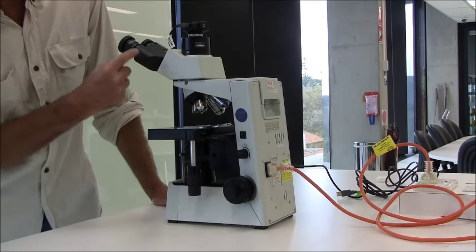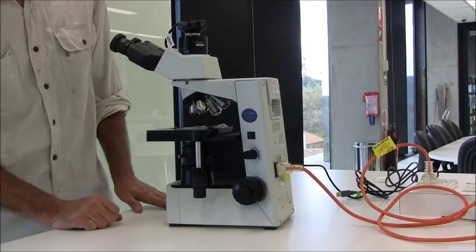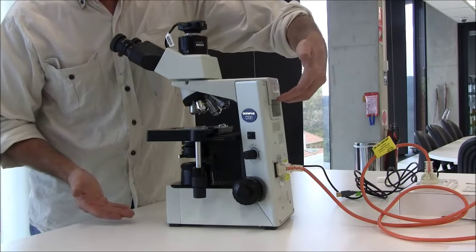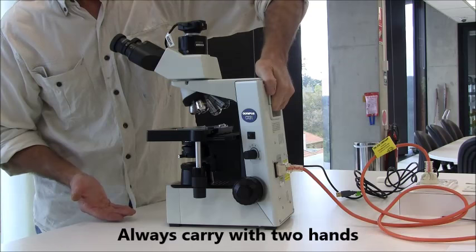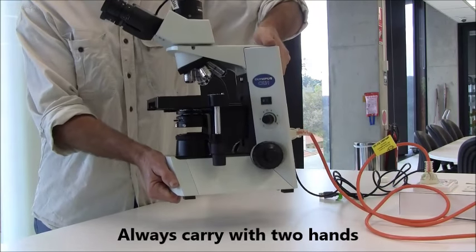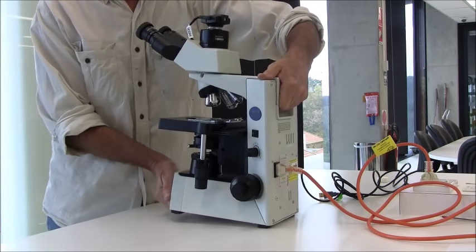So that's the path of the light. Looking at the parts of the microscope — I'd like to direct your attention to the handles for moving this microscope. They are quite heavy. There's a very convenient handle up on the post and one under the front. So when moving these, it's a two-hand grip — gently set it onto the bench.